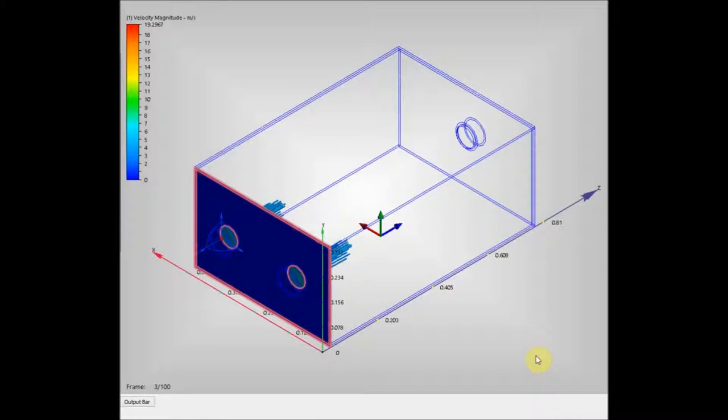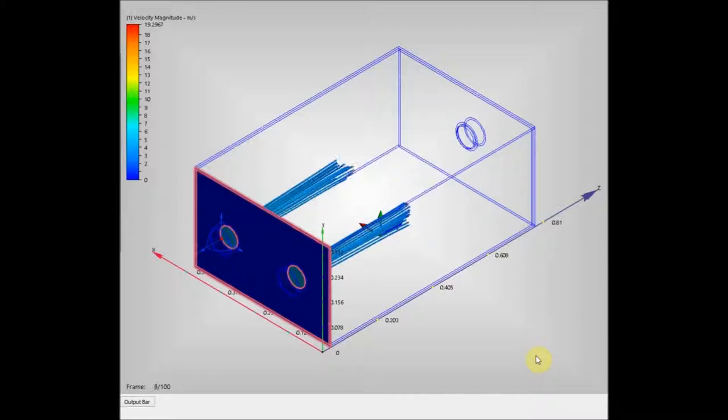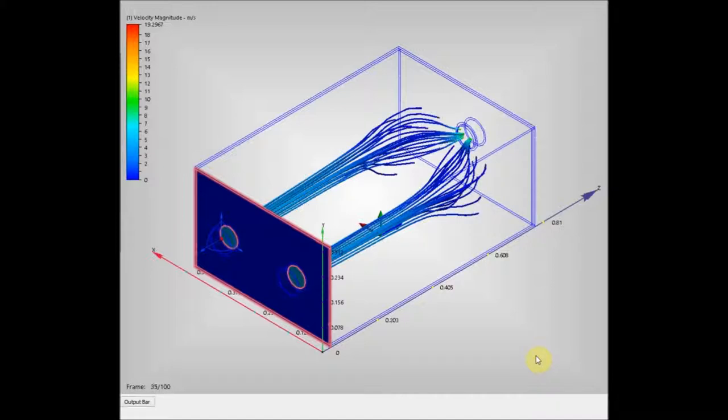And then this section that we're actually looking at now, these are the particle traces. So these give us more of an idea of where the airflow is going to be concentrated. And you can see that there's a large section in front of the two choice chambers on the left hand side of the screen where the airflow is in the cyan colours, the pale bluey greens, which is going to be too fast, I think, for the mosquitoes to actually get into those chambers with the air flows as they are.